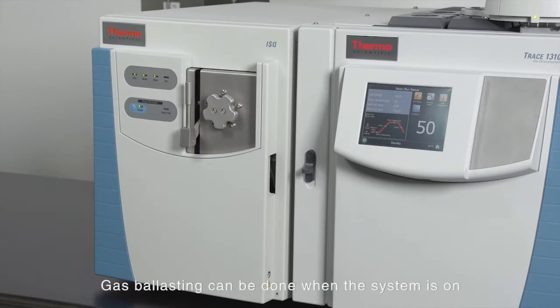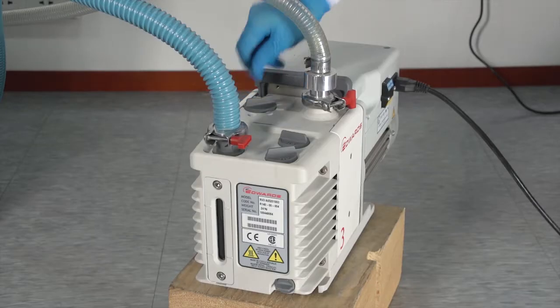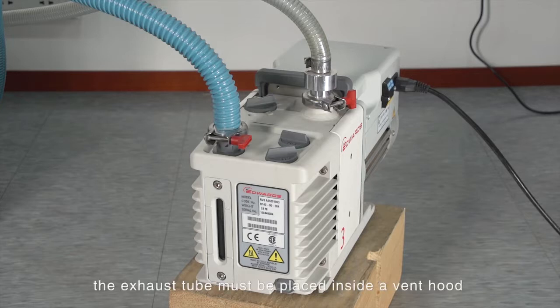Gas ballasting can be done when the system is on. Turn the ballast knob from 0 to 1 or 2 to enter the ballasting mode. During ballasting, there will be a lot of chemical fumes coming from the exhaust tube. For safety reasons, the exhaust tube must be placed inside a vent hood or outside the window.